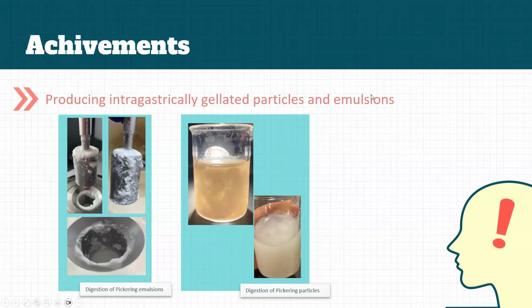Esma brought out a very good point. For instance, with these particulate ones, when you do it in conventional rheology, the error rates are also quite high. But with flow imaging, when you obtain a profile, it can be easier to obtain the rheological constants. Yes, hocam. Thank you, Esma.